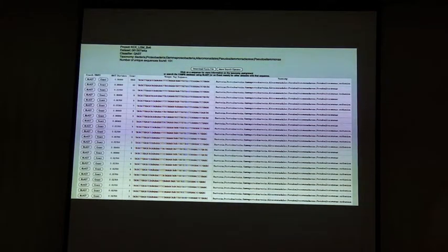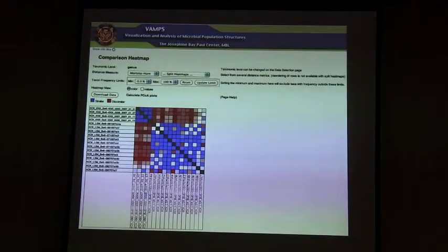You can do other things. You can take that sequence and look for exact matches against any other sequence in our database, or you could BLAST our database. So you could look for any other community that might have that sequence, and it'll give you a report. Sadly, this takes some time. So that's one of the functions that's not quite so instantaneous.